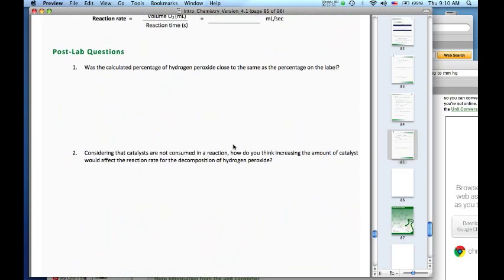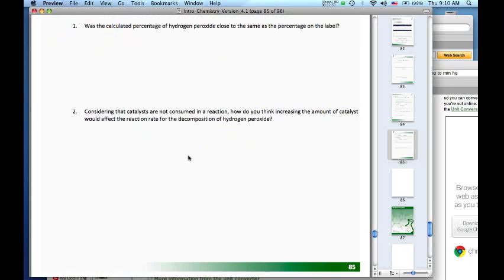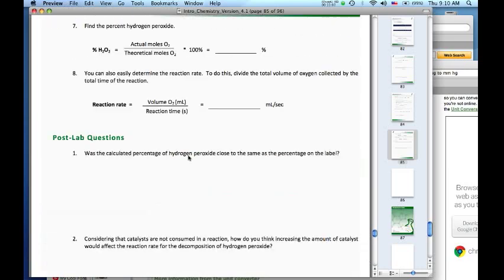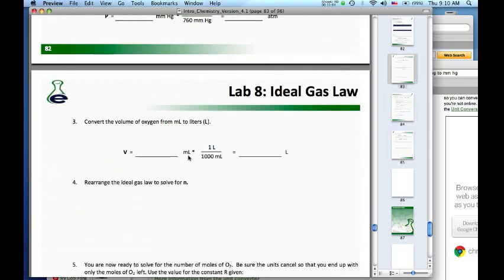And we'll increase the amount of catalyst. Well, you can try this out. There's always a limit. You can just add more yeast and do it again if you want. But catalysts do speed up a chemical reaction. This one's a little difficult to do, so try your best.